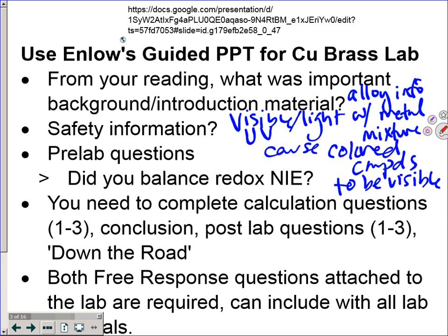Why are you guys being so quiet? Give me some information here, okay? Give me one more thing, Megan. From the background, I was going to give you like... Can you give me some more? But it's used for Beer's law, it's one of the variables that gets used.